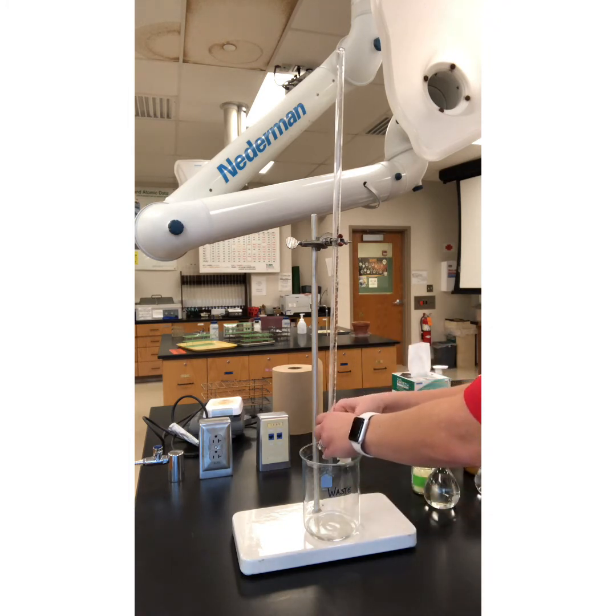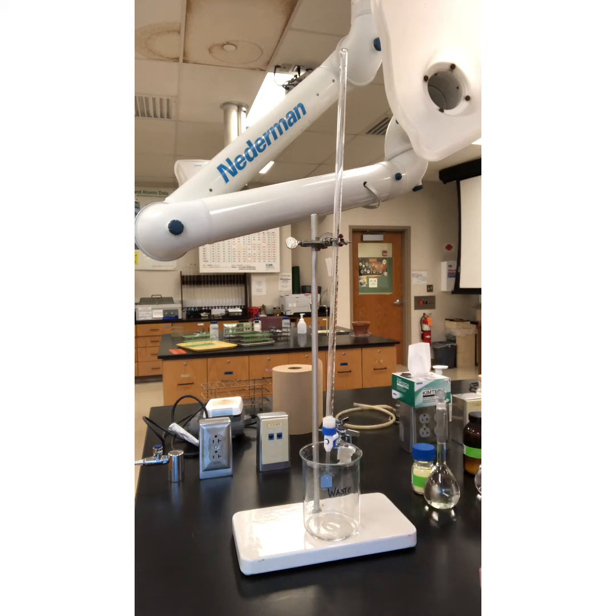When it is parallel with the piece of glassware, then it is open and will allow your titrant to flow down to your solution. Right now I just have my waste container to catch the waste as we prepare the burette full of zinc sulfate.